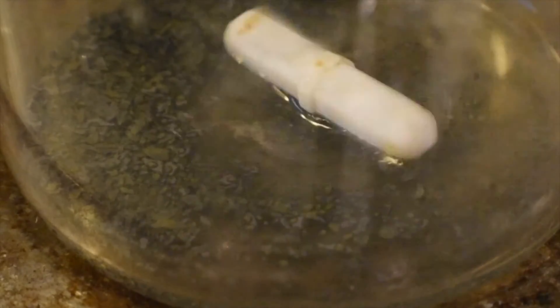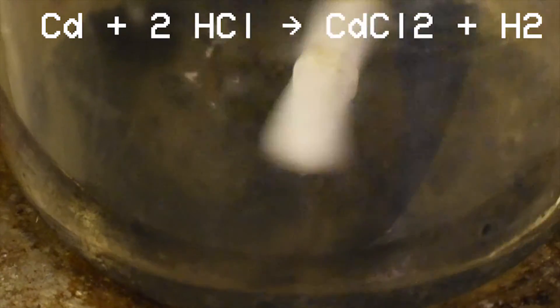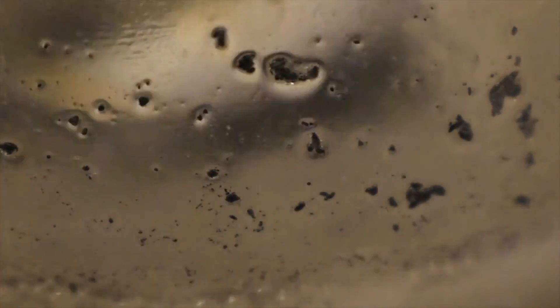The next step is to turn the cadmium metal into a salt. I have it in a beaker with a stir bar, and I'll turn on slow stirring and then add enough hydrochloric acid so that it no longer reacts with the cadmium. What we're doing is converting cadmium metal into cadmium chloride. The reaction is: cadmium plus hydrochloric acid yields cadmium chloride and hydrogen gas. Once it's fully dissolved and I've added more hydrochloric acid, we can come back and continue to the next step.